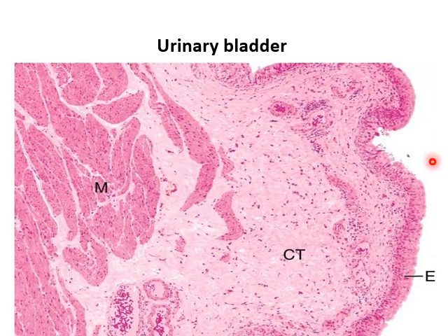A rounded structure with a lumen: we also have the urinary bladder. The urinary bladder is lined with transitional epithelium. What do you know about transitional epithelium? The basement membrane is non-clear, non-wavy. It is a stratified epithelium, and all of the nuclei are rounded. The most superficial cells are large cells, okay? It is formed of mucosa, musculosa, and adventitia.